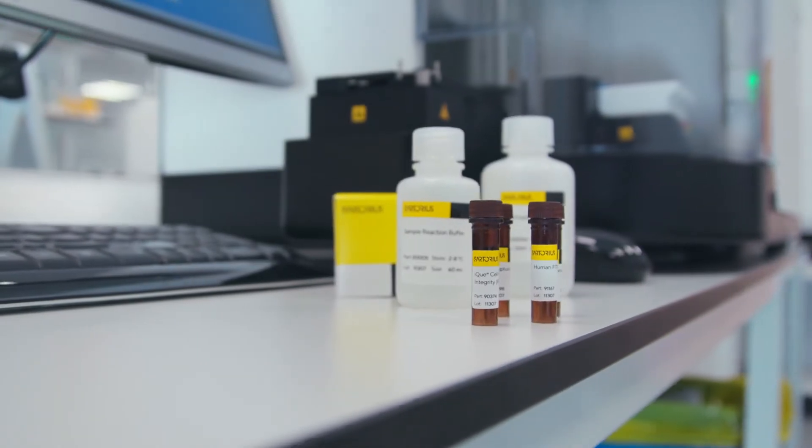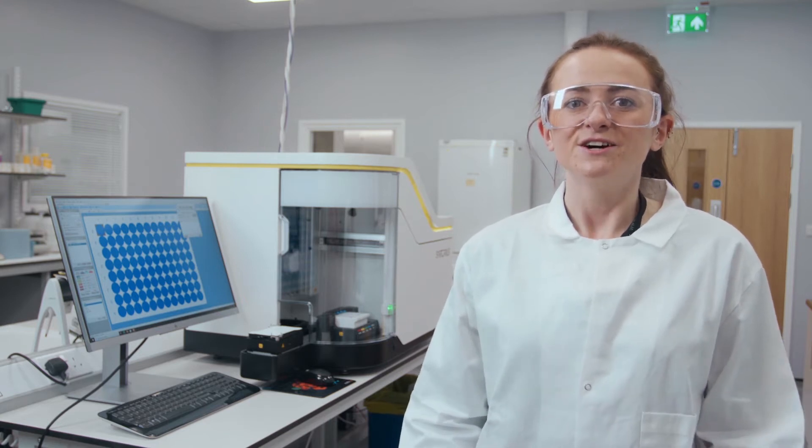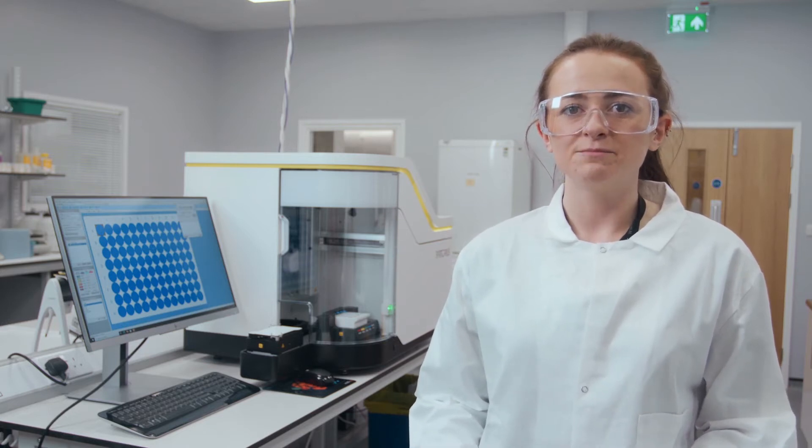Let's look at using the IQ3 with the IQHuman IgG Titer and Viability Kit. We have developed assay kits to provide you with easy-to-use solutions. The titer and viability kit is a multiplexed assay for screening samples and can simultaneously report on IgG quantity, cell number, and cell viability in a single well for cell line production screening plates.